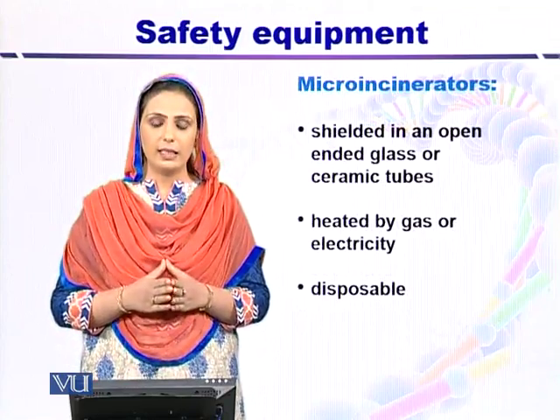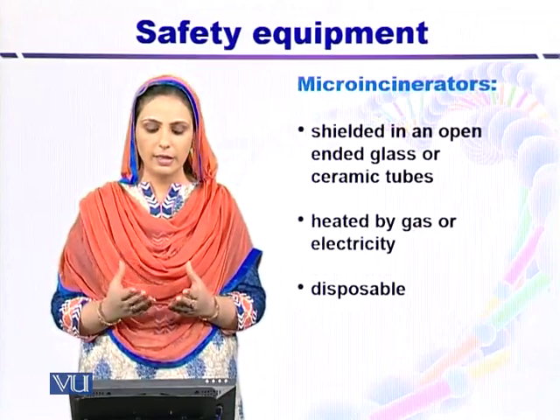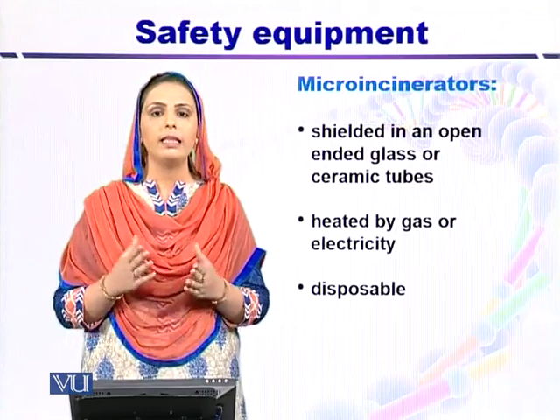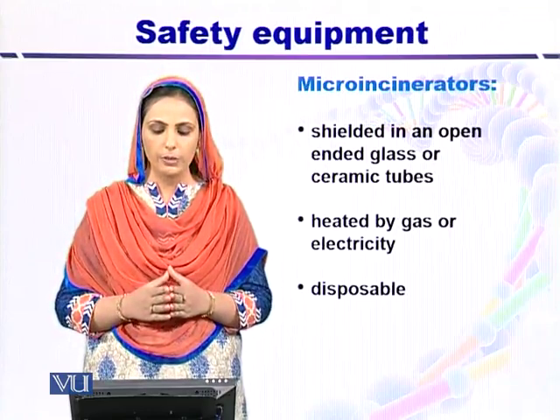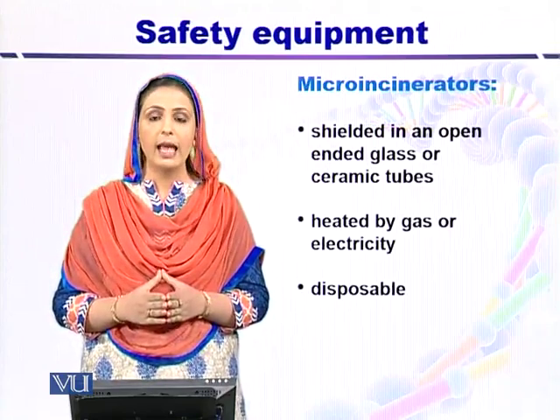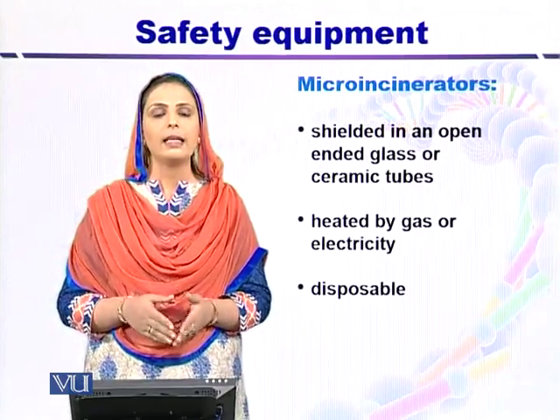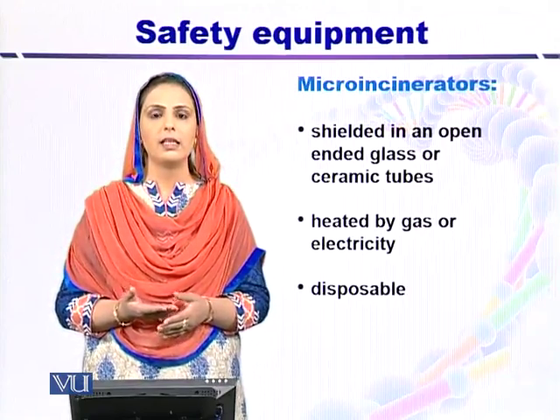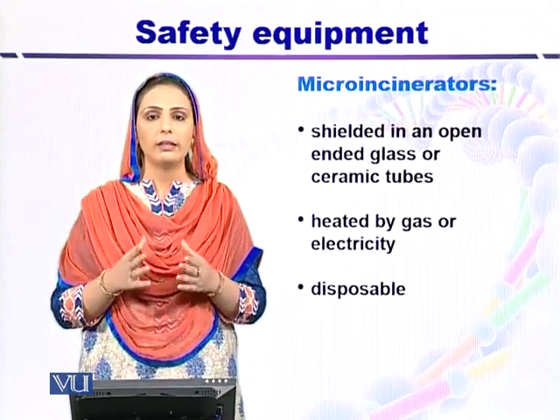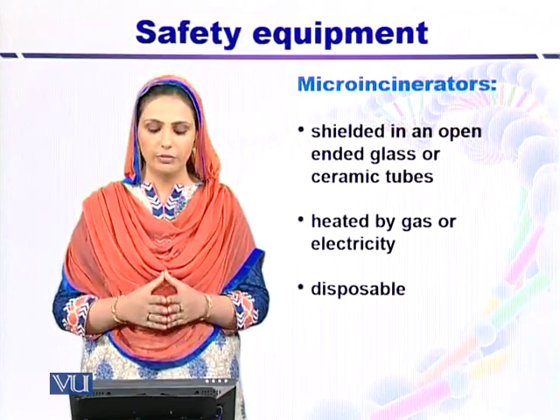Now micro incinerators. Micro incinerators are made up of glass or ceramic, and these are shielded in an open-ended way with these glass or ceramic tubes. So they can be simply heated by gas or electricity, and the most important thing is that they are disposable. Again, we don't use micro incinerators in the biosafety cabinets because they can interfere with the ventilation system of the biosafety cabinet.